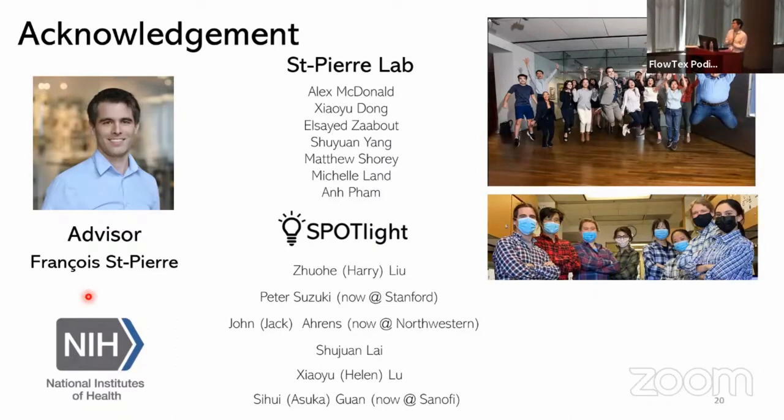So in practice, we isolated around 200 cells max, and it took around 2 hours for us. So we had imaging, then 2 hours of optical tagging, and then back to sorting. But we can reduce that time now.